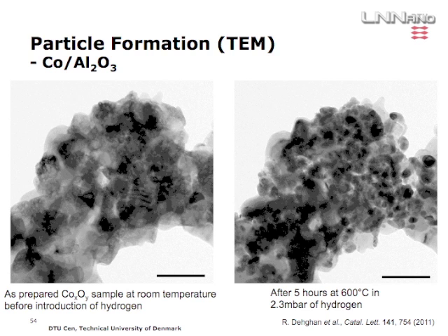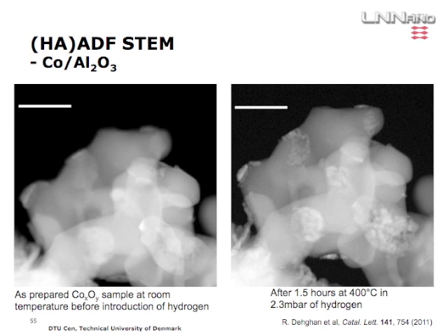And it might not be so impressive in TEM, so what we did is we did it in STEM instead, where you get an atomic number contrast. So you can see over here you have patches all over the place of, maybe this is the most clear one, of oxide, and over here you see that after treatment in hydrogen, the patches are broken up into individual particles.